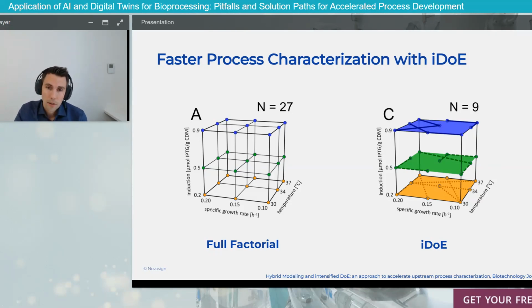By doing so, you can visualize here that we are packing multiple parameter combinations in a single experiment. In this case, we pack 3 parameter combinations in one experiment, so you can still screen the whole design space, but with 1/3 of the experiments. So you can think about saving 70% of experimental effort by this approach in this particular showcase.